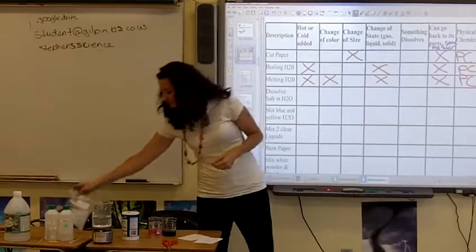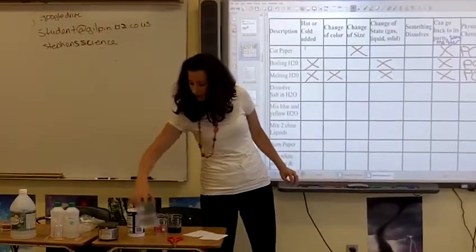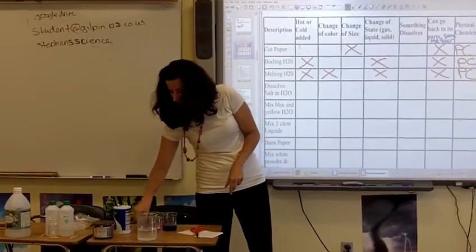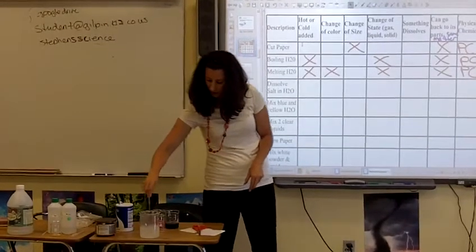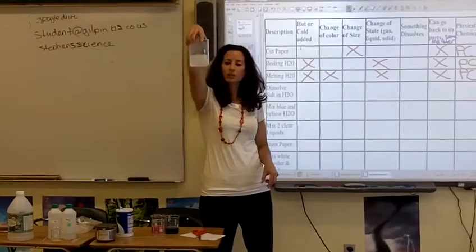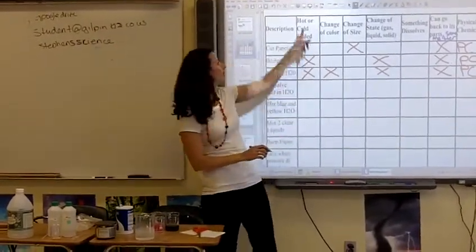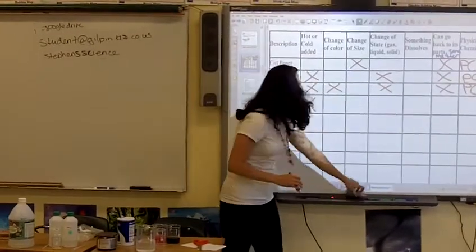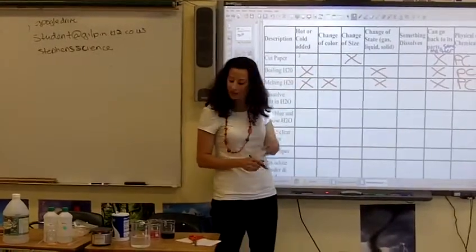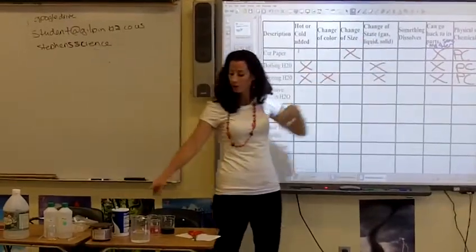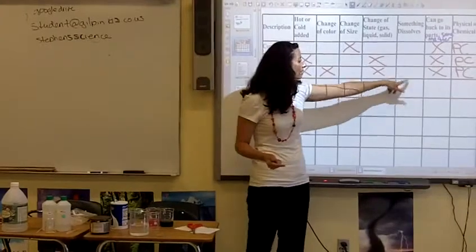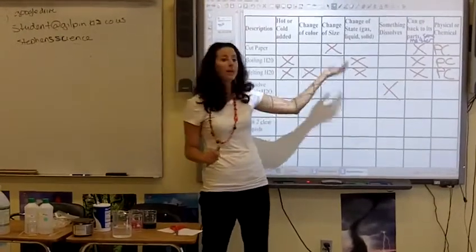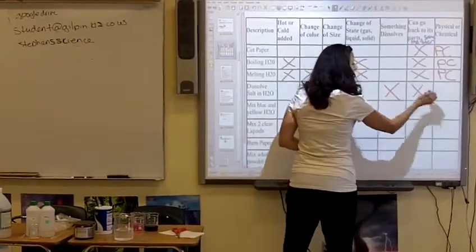The next demo is dissolving salt in water. I'm going to take the beaker off the hot plate and put some salt in, then stir it. Was hot or cold added? No. Change in color? No. Change in size? No — we still have water and salt in there. Change in state? Water is still a liquid; the salt is still a solid in the water. Did something dissolve? Yes. Can it go back? If I evaporate the water, the salt will be left — so I can separate it back into salt and water. That's a physical change.